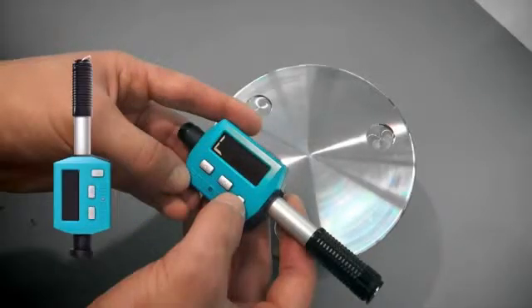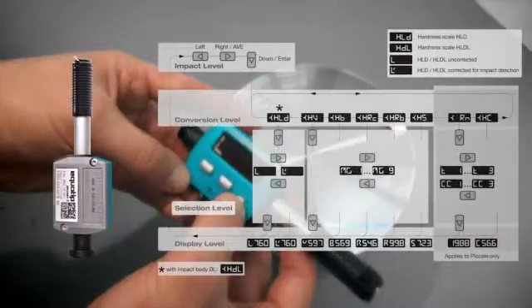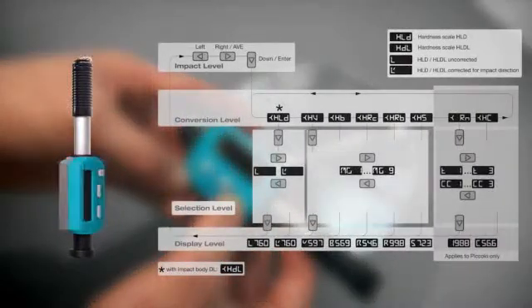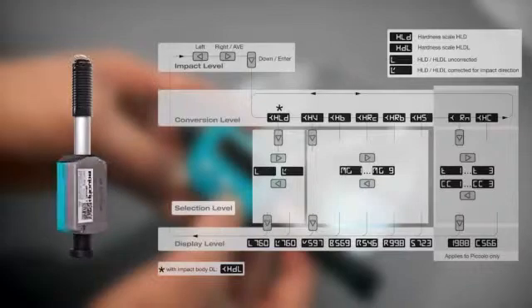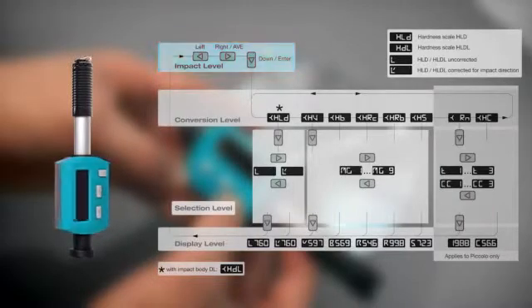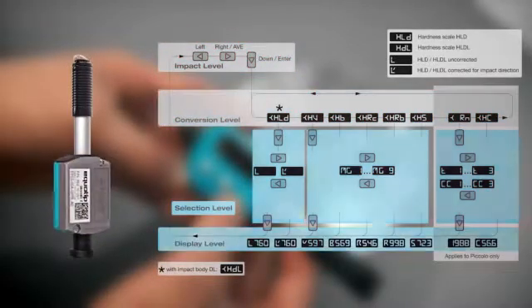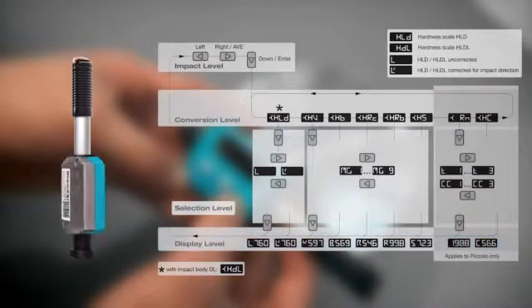To understand how to operate the EchoTip Piccolo, have a look at the following graphic. As you can see, there are four operating levels: the impact, the conversion, the selection, and the display level. To navigate within these different levels, press the respective keys.